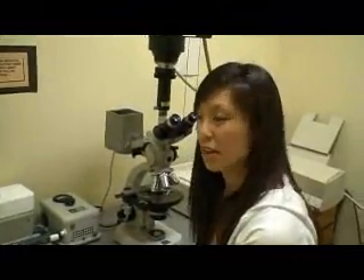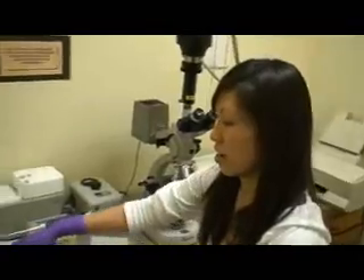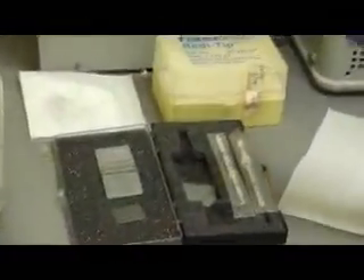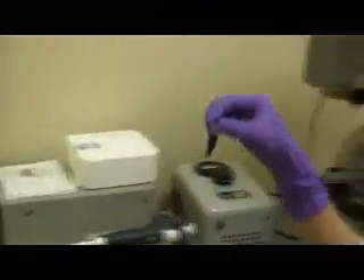Hi, my name is Sabrina, and we're going to count cells with the hemocytometer today. To begin counting, you need a set of hemocytometer and a 10 microliter pipette, and you need your cell sample.